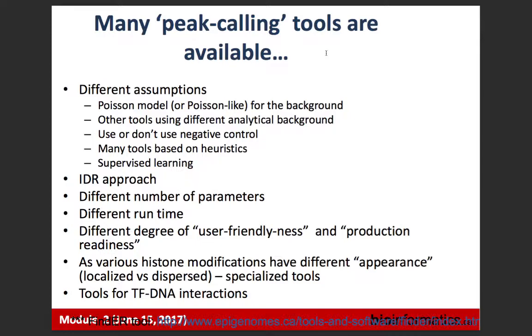Yes, I mean, from the user perspective, there are many, many requirements. Sometimes you download the tool, sometimes tools are written in a very exotic language. You try to run it, the system didn't install this environment for you, you don't know how to run it. Many tools, you download them, they were published a few years ago, they're not supported. They don't run. And I was there many times that I can't run it, so then you contact authors.